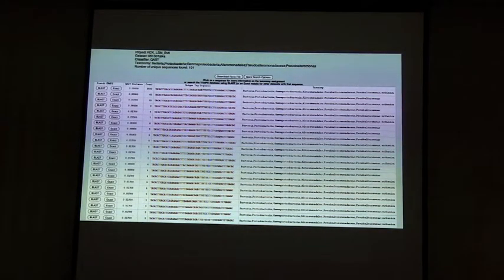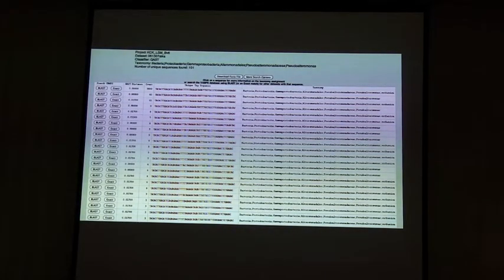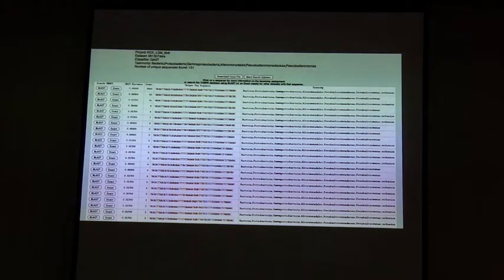We make use of a process called GAST. I was going to show you how GAST worked, but GAST has recently changed. It's a methodology that's more sensitive than just using BLAST to try and find the very best match against a reference database. I don't know if Sue's going to have time to talk about that. Probably not. Okay, so Sue's not going to go into it, and I took the one slide I had out of my presentation because it's no longer current.